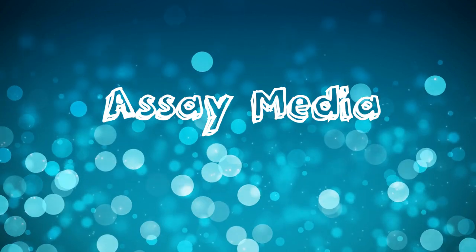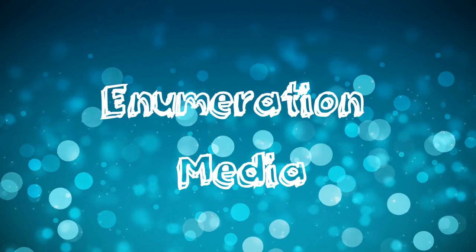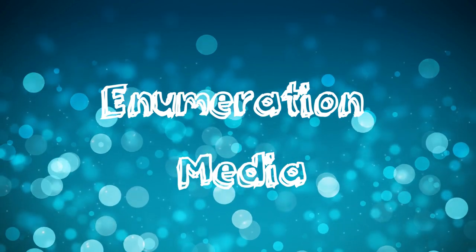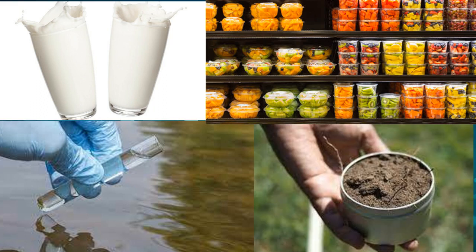Assay media are used to test the effectiveness of antimicrobial drugs. Enumeration media are used by industrial and environmental microbiologists to count the number of organisms in milk, water, food, soil, and other samples.